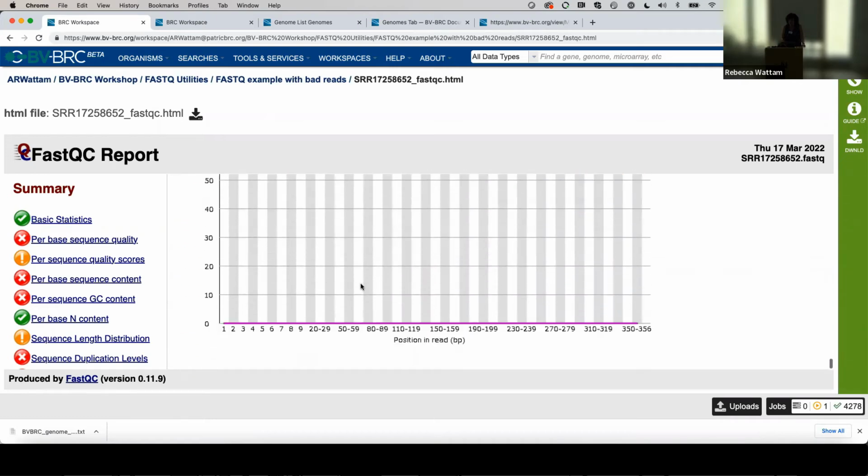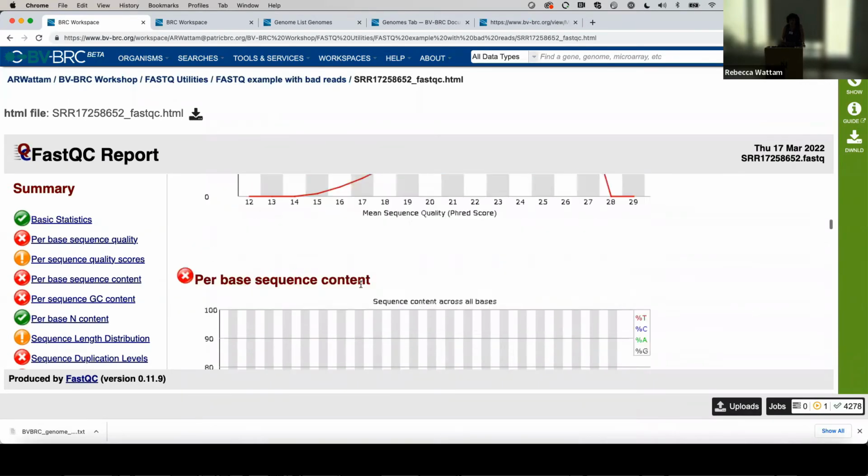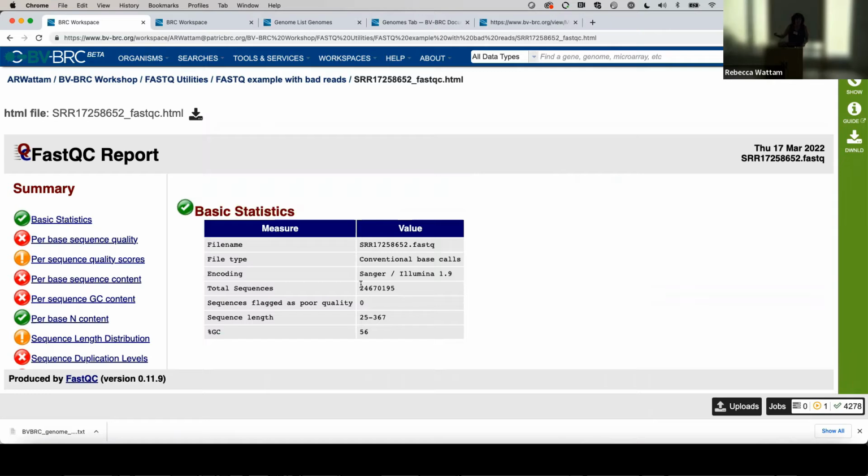And you know what? I have tried trimming this. I've tried a lot of things with this thing. This is just not a great sample except for one thing. If you work with SARS coronavirus, this is a really great sample. So you could align the data to the Wuhan reference genome, and if you wanted to pull it out of that, you could do that.